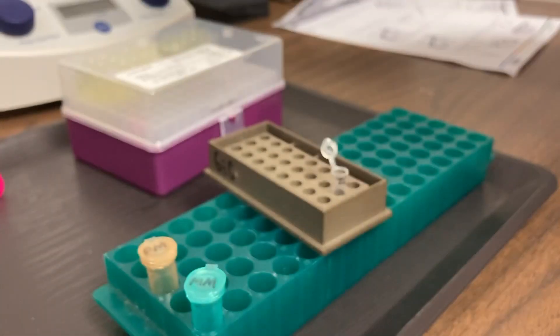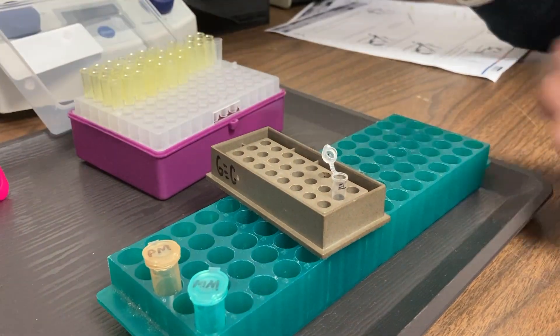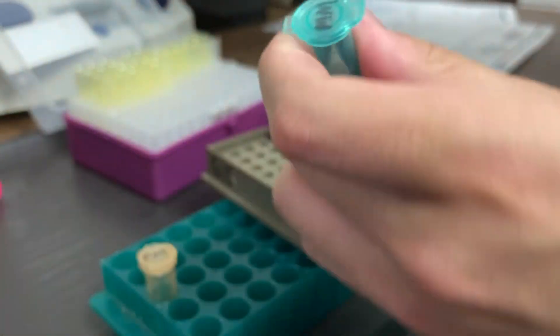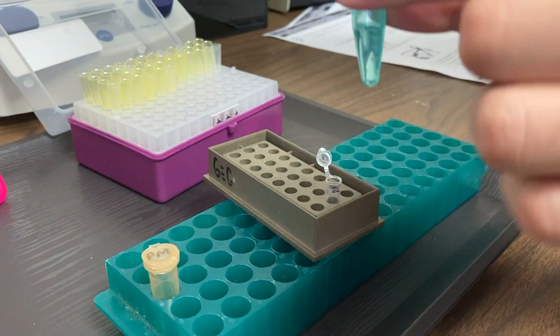Next, we'll set up our PCR reactions. First, we'll set the volume of our micropipet to 20 microliters and we'll add our master mix to our PCR tubes.